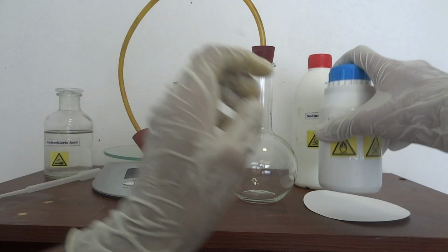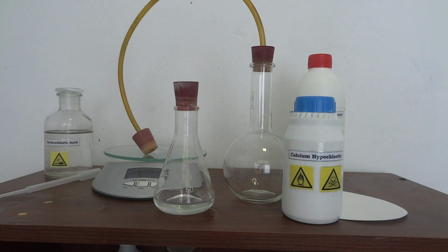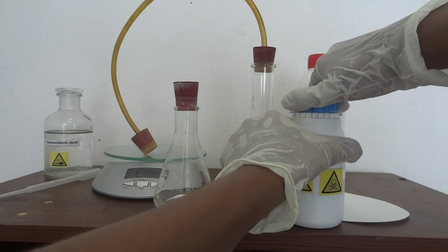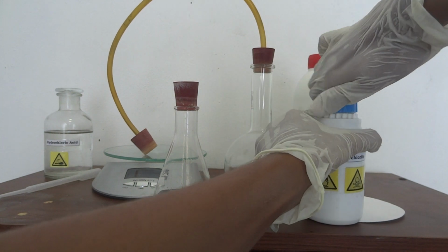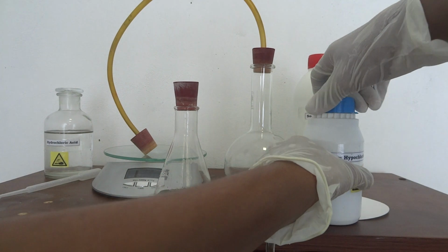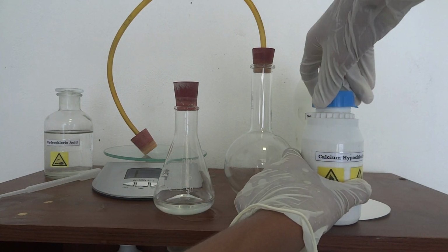Now this is a bit dangerous part. Add in the calcium hypochlorite. From my metal spatula, I'll take a little bit of this calcium hypochlorite, quickly put it into this hydrochloric acid and stop it with this cork, which has a rubber tubing, to this flat bottom flask, so our chlorine gas can be collected there.